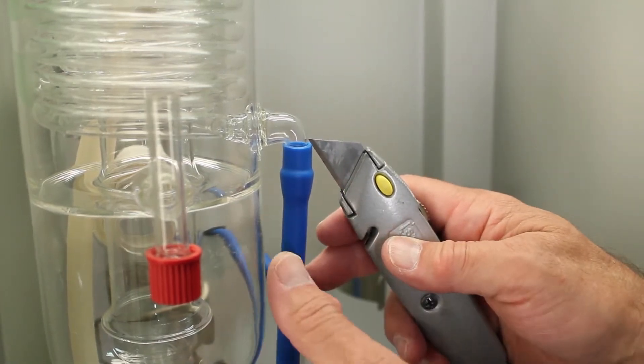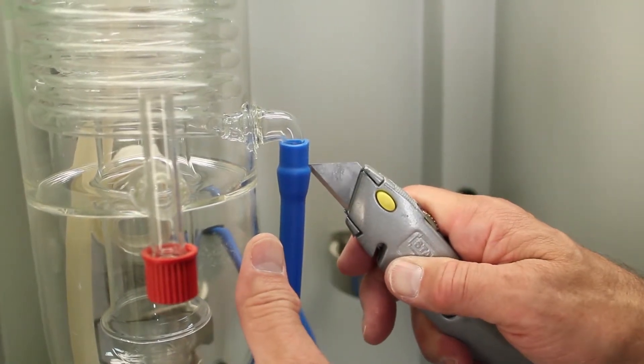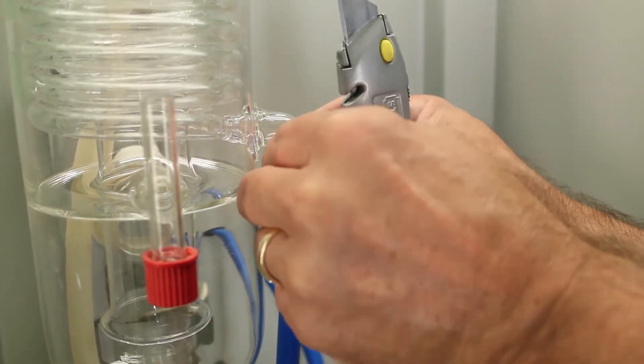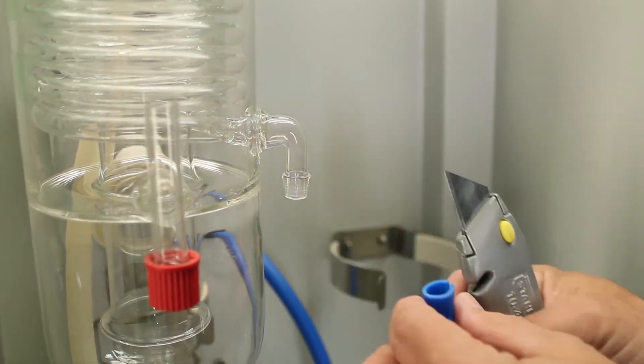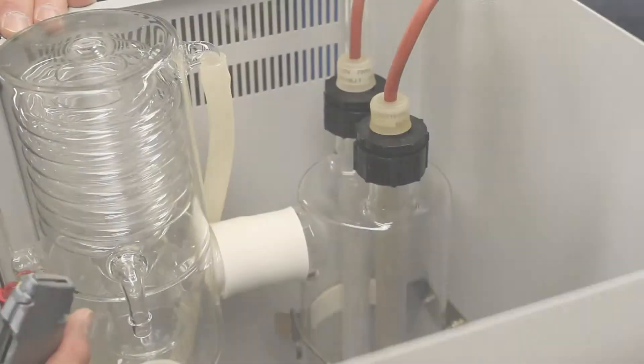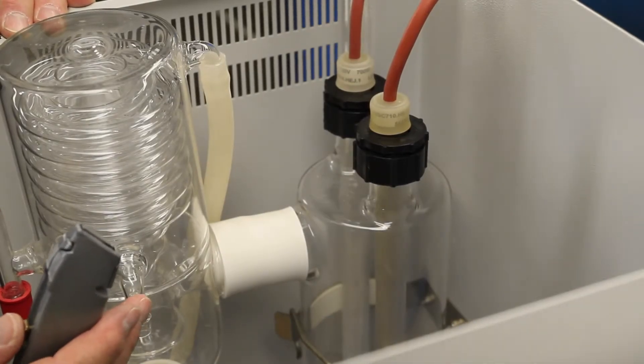Just take a knife, cut it down, peel that around, and it'll pull the tube right off. Now that we have the inlet to the condenser tubing removed, we're going to remove the outlet tubing from the condenser.